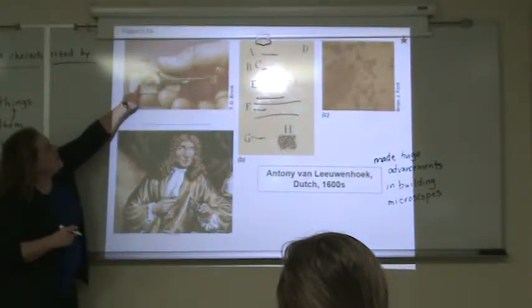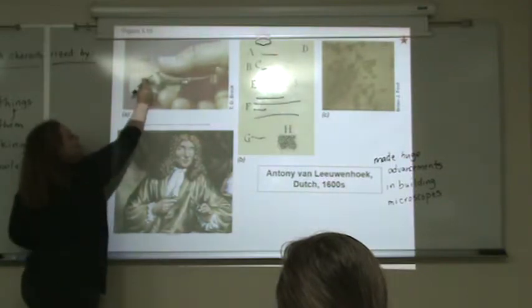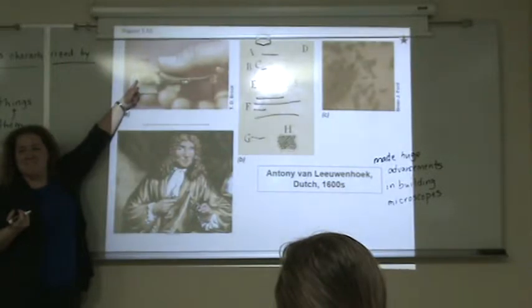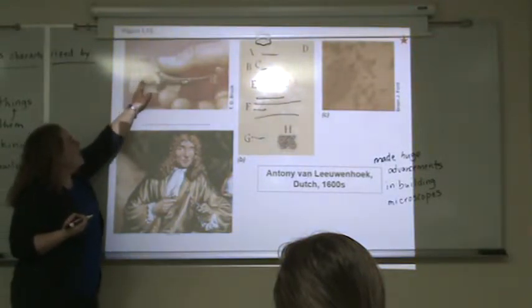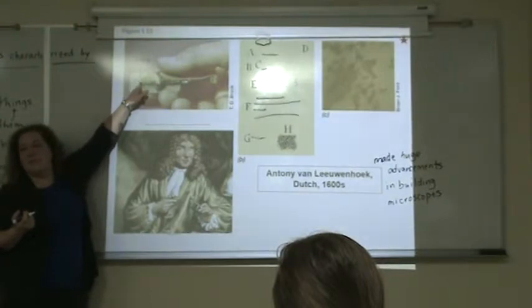There's a little spherical lens. This is like a pinhead screw. That would be the stage. And then you crank it up, crank it down. And this would be a fixed distance lens, yeah.